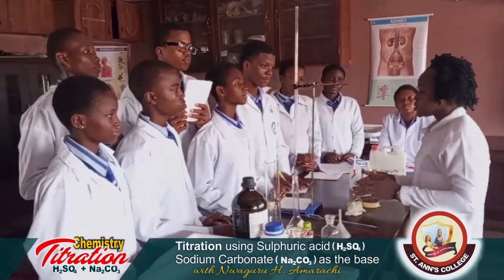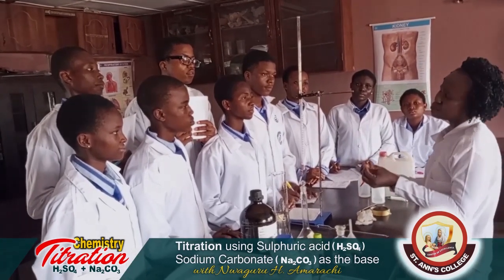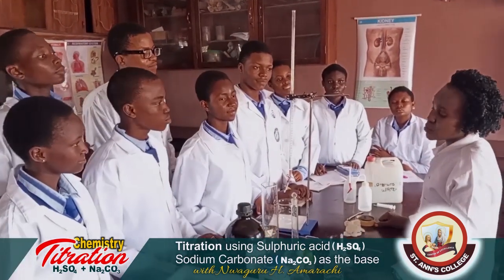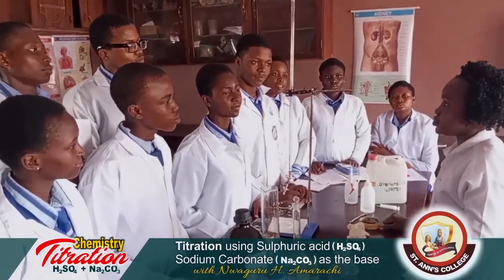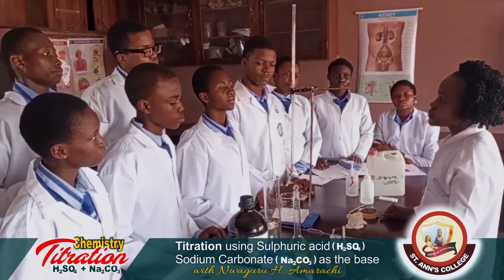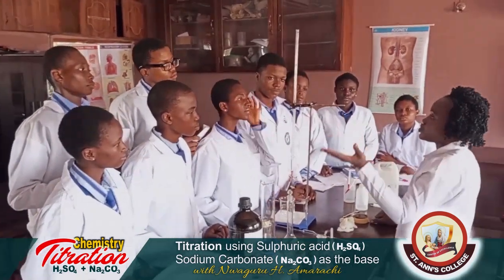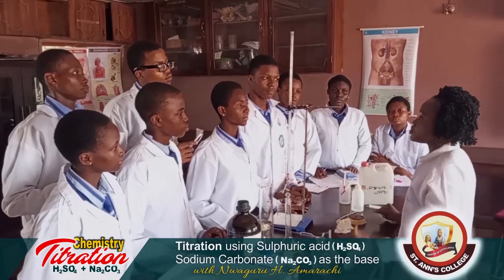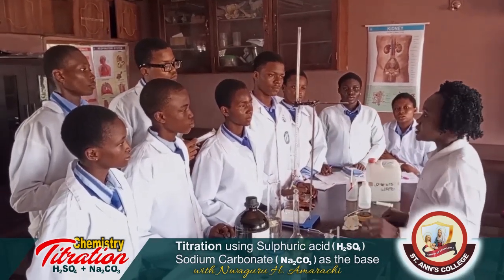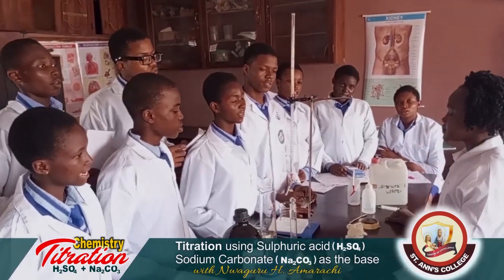In our next class, we are going to do the calculations on this titration. There are some other calculations attached to this practical concerning the acid and base. One, we didn't know the concentration of the acid we used. We also didn't know the concentration of the base we used. We need to calculate the concentration of A, which is the acid, and also the concentration of B, which is the base. Am I communicating? Yes.